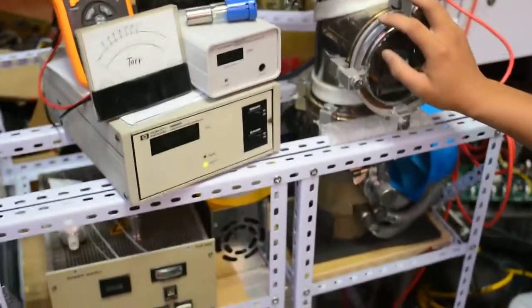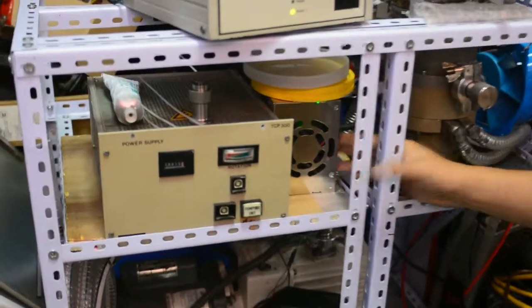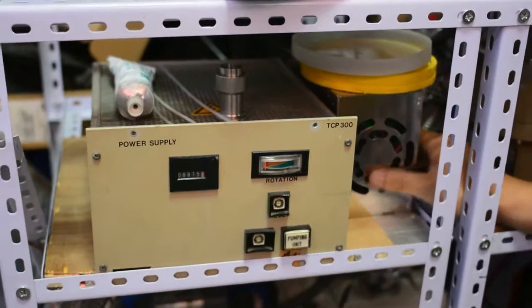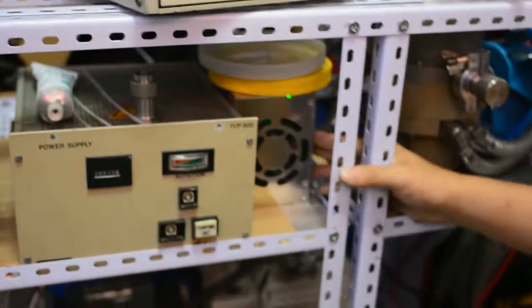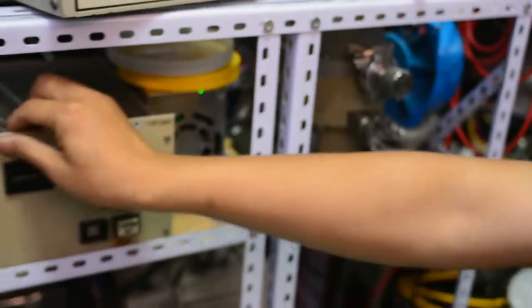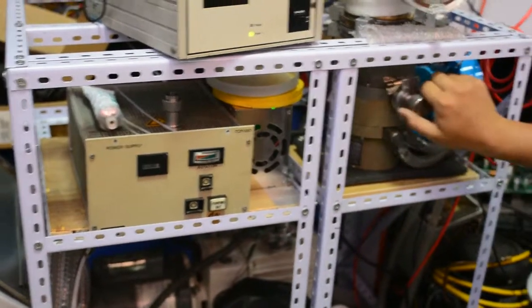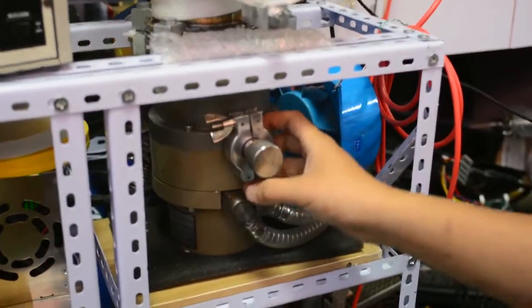Let me show the power supply system. This is a low voltage power supply providing 24 volts DC to power all the gauges. This is the control unit power supply, which powers up the turbo molecular pump — all made by Pfeiffer vacuum. This is the inlet valve used to vent the vacuum chamber.